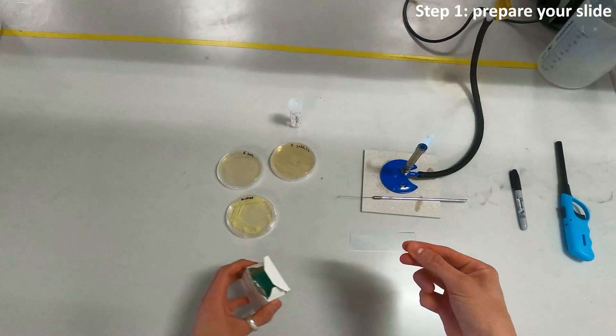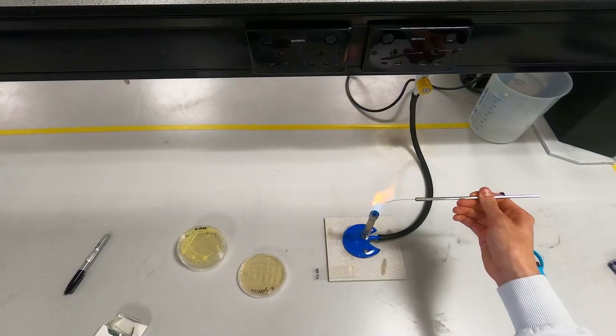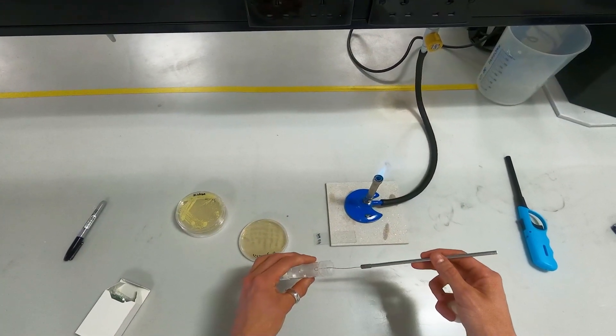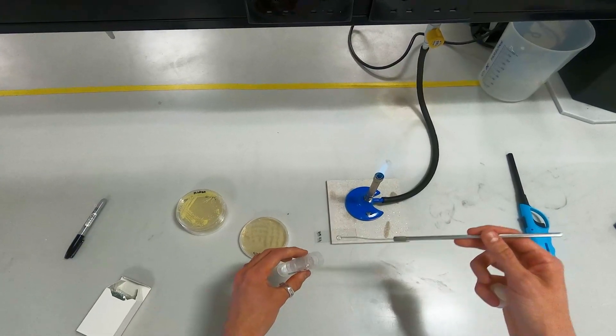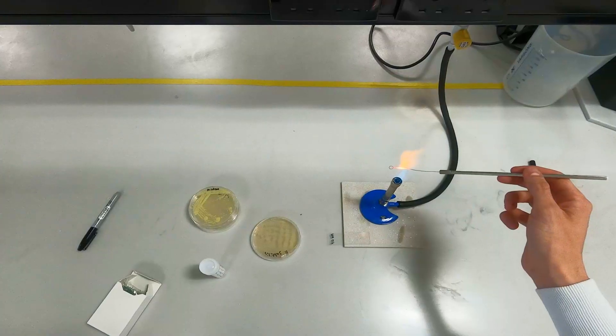Now it's time to prepare your slide, so label it something appropriate before putting it down to flame your inoculation loop. Pick some water up with your sterile inoculation loop - you should be able to pick some up within the loop itself and it should look just like that. Place the water droplet onto the slide and flame your loop again before you put it down.